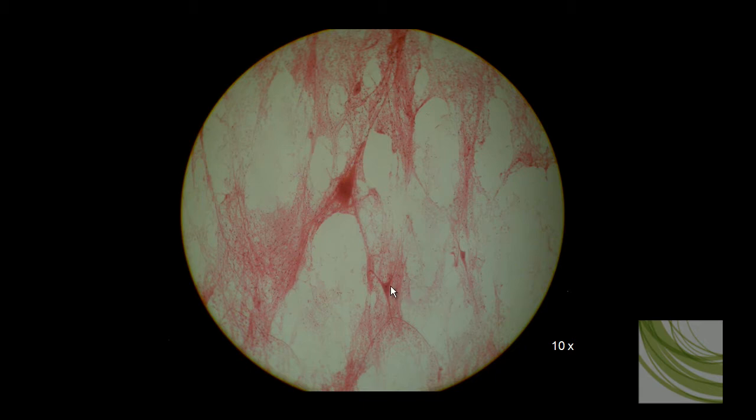We see another cell body but it's very difficult to tell the dendrites from the axon in that one, as is this cell body and this cell body. This one does look like there are some dendrites coming off up here.